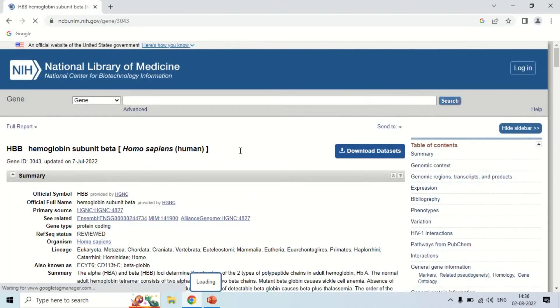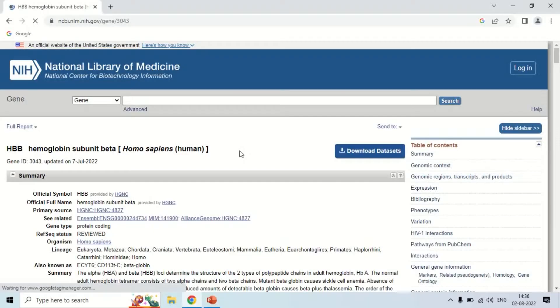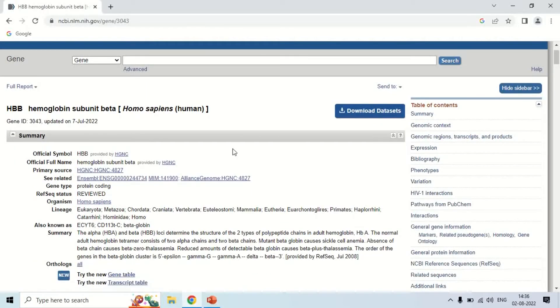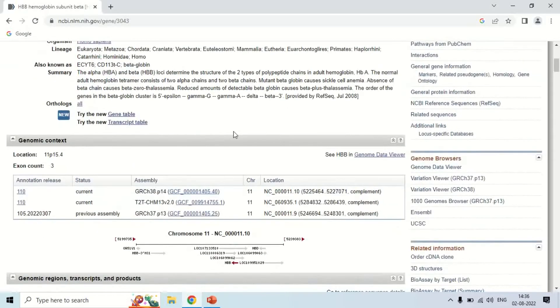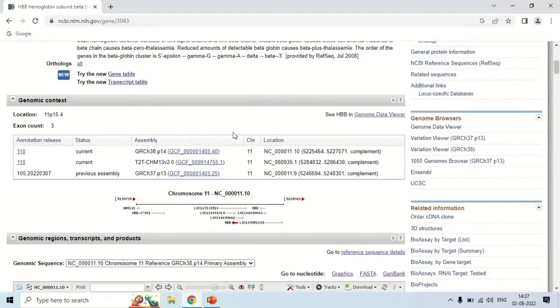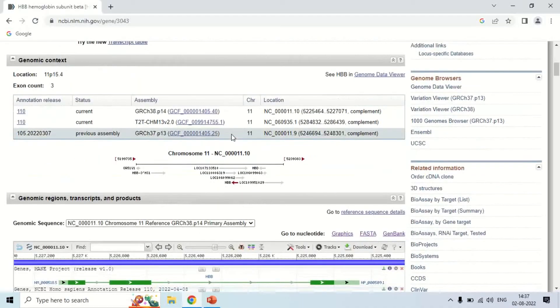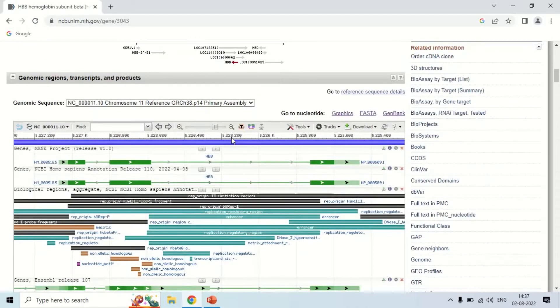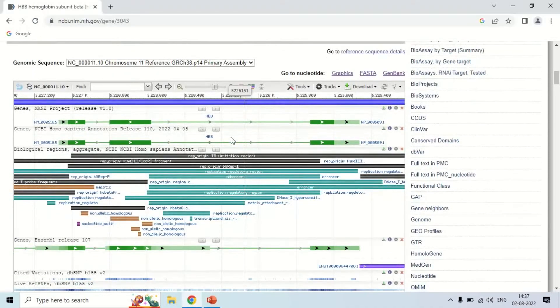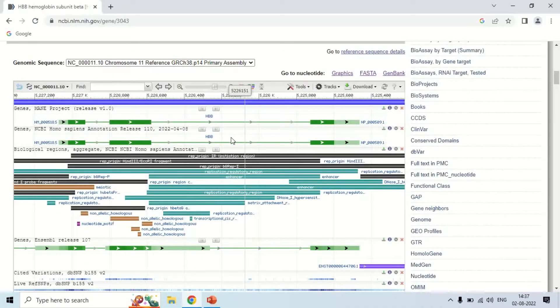This page shows information about the hemoglobin beta gene of homo sapiens. The basic information includes its symbol HBB, the official name hemoglobin beta, and other details. To design the primer using this information, scroll down to the graphical section.